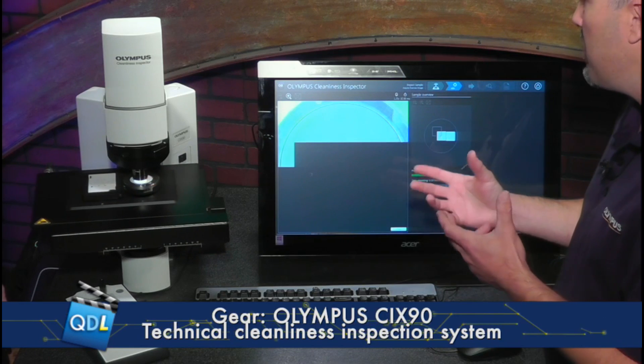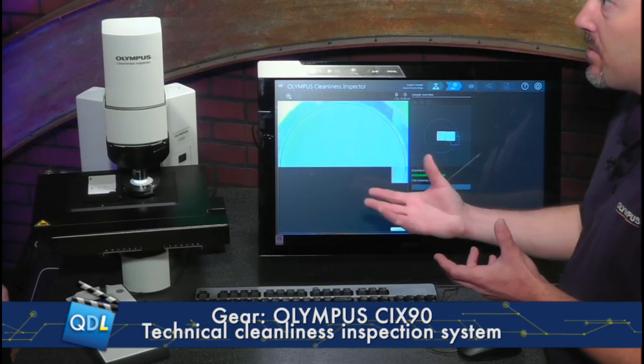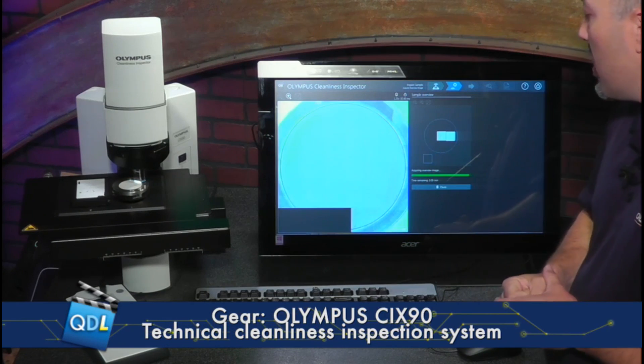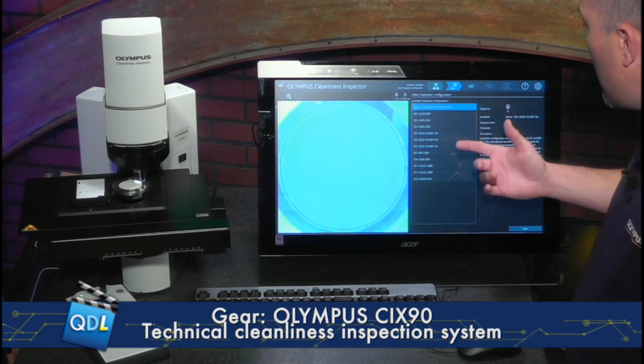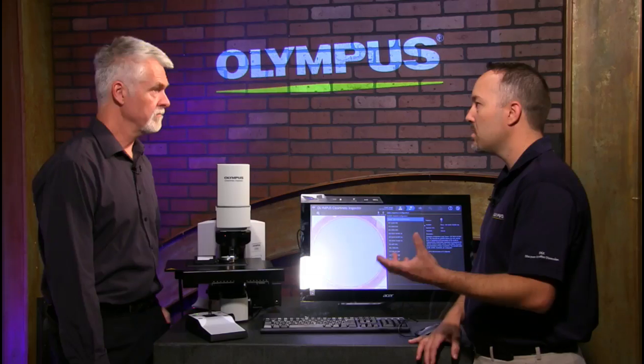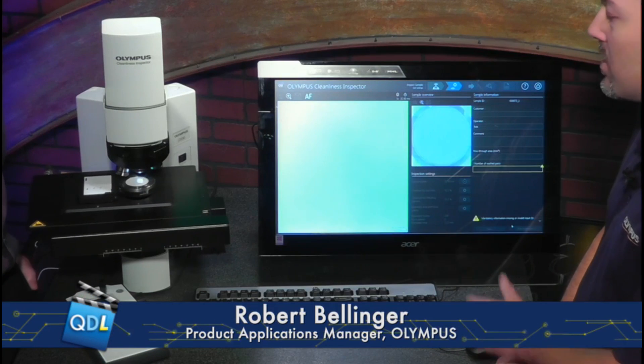This overview scan is used for a couple of things: to make sure everything looks good as far as the sample surface of the filter, and also to look at where their flow-through areas are — where the water actually went through on the filter paper. The next step in the process is going to ask them for an inspection configuration. This configuration sets the microscope up and sets the standard they want to use. On the right here, it describes everything on the screen — what it's going to scan with magnification-wise, the standard they want to use, and even has a great area for them to type in descriptions. They might use different inspection configurations for different parts, as different materials may have different requirements. Once they select what they have, they simply hit next and it selects the right magnification.